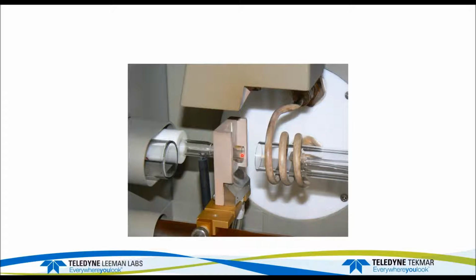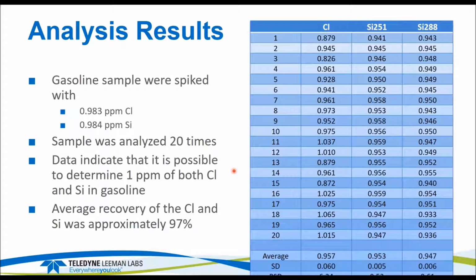When you want to run chlorine, you want to make sure there's no air. Even that little bit of air that would be coming in through the knife here doesn't affect normal wavelengths, like the 167 aluminum line or the sulfur or anything like that, but it would make a difference for chlorine, for halogens. So we extend that in there, and that allows us to have essentially no air. There's no air getting from the plasma into the entrance optics of the instrument.